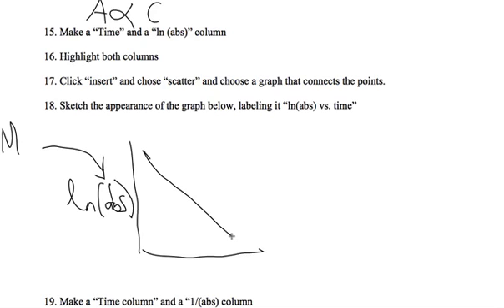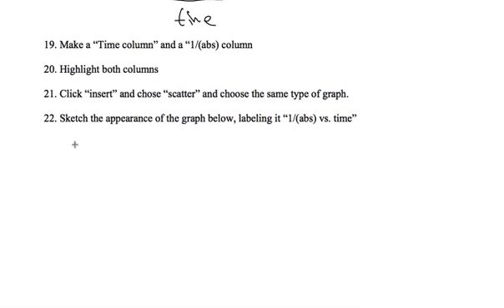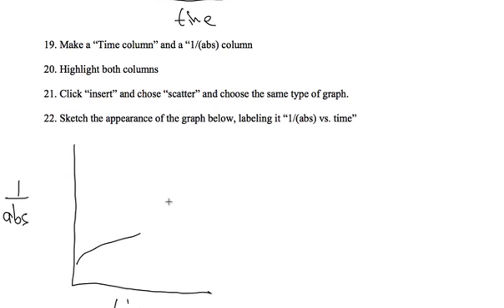Most people got a fairly linear slope for that. And 1 over absorbance versus time, I think for people wasn't as linear.